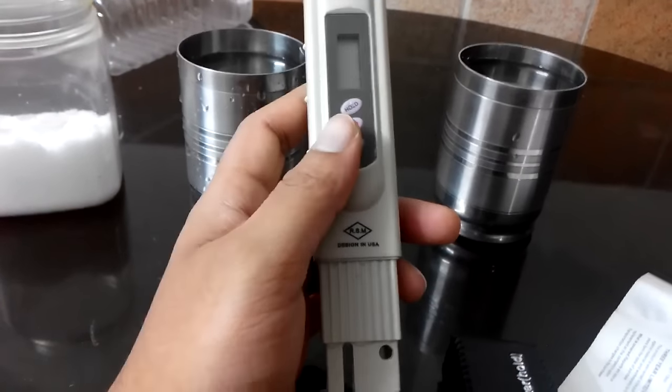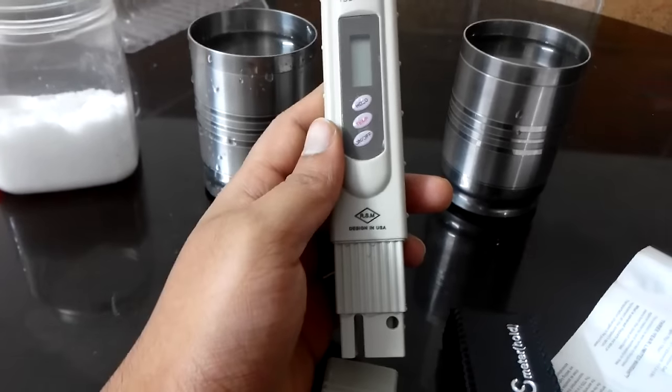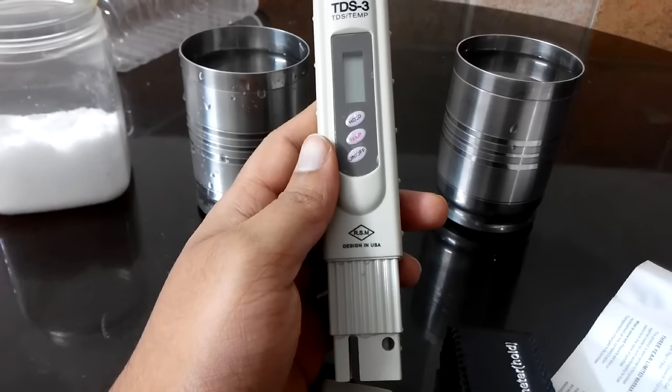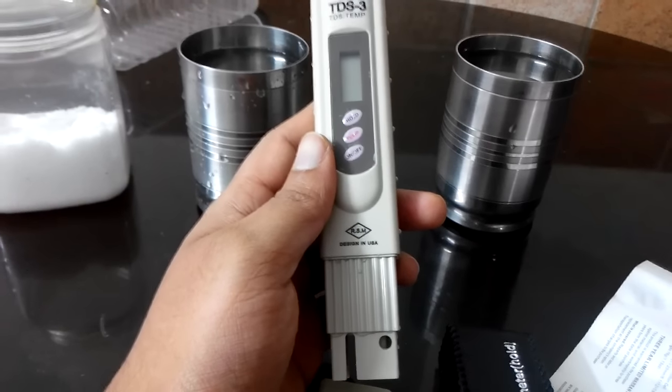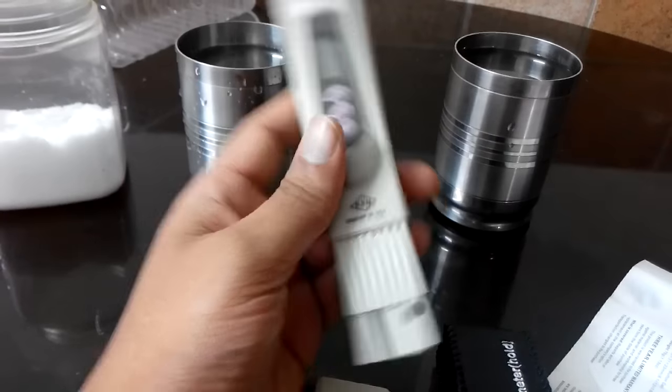The hold button is used when you put it inside water and you want the reading to stay there for a while. You can press hold, otherwise it will disappear. And there's this cap. This came with a carry case and a manual.